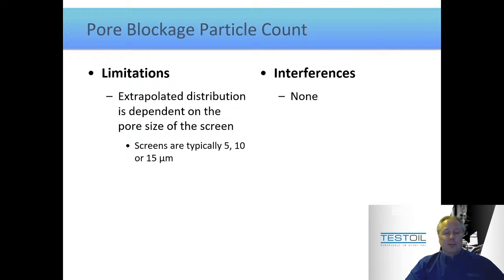Air bubbles, water molecules, and any oxidation byproducts have no impact on this test, which means we can run this test without any special preparation to the sample, which would be required for optical particle counting. And the issue that some people would have with any preparation required for optical particle counting is it could start to skew the numbers away from reality.